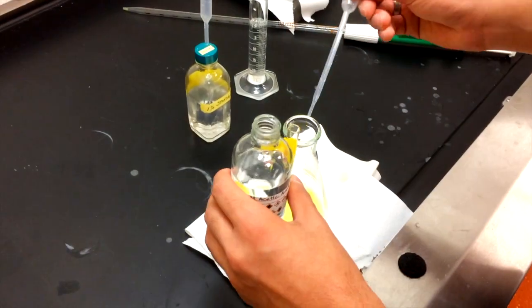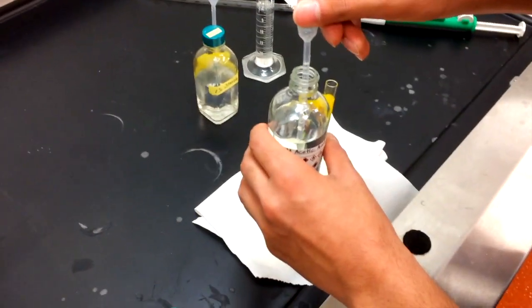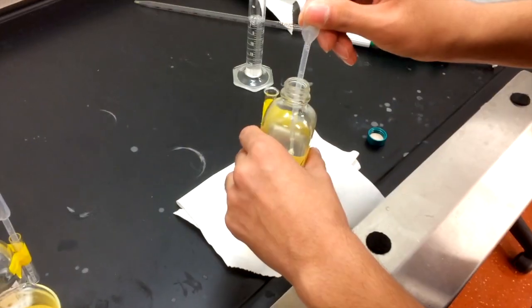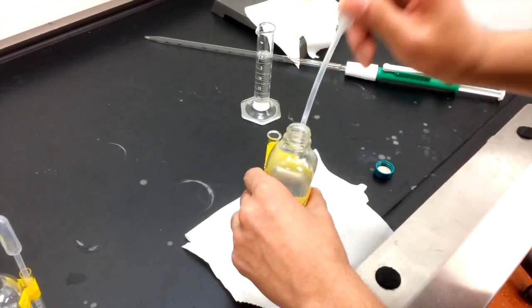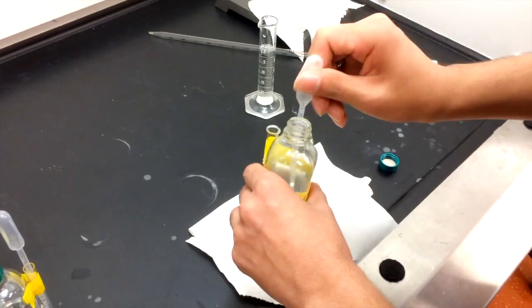Add 2 milliliters of 6 molar acetic acid and 4 milliliters of 1% starch. Give it a small stir and set that aside.